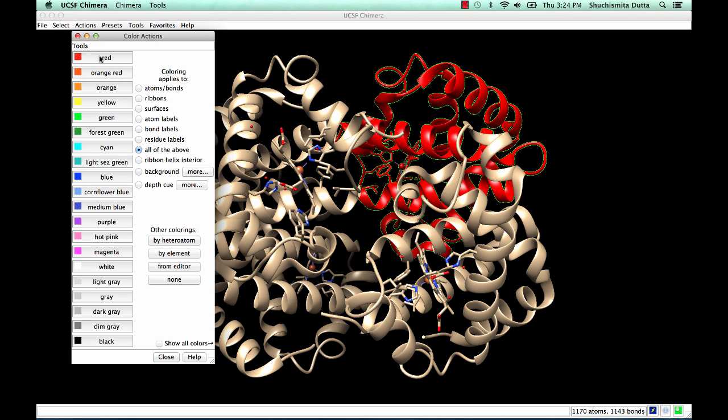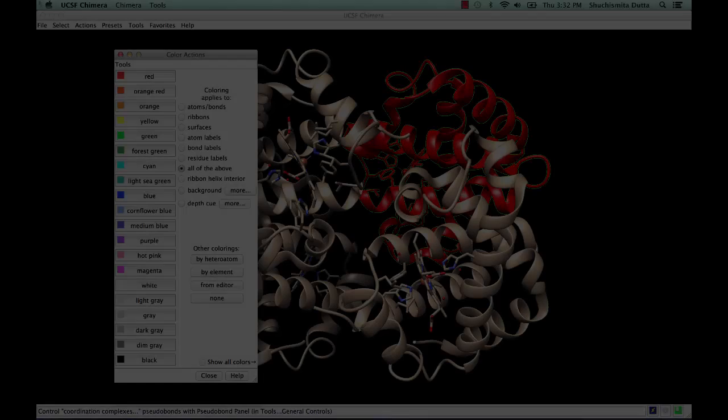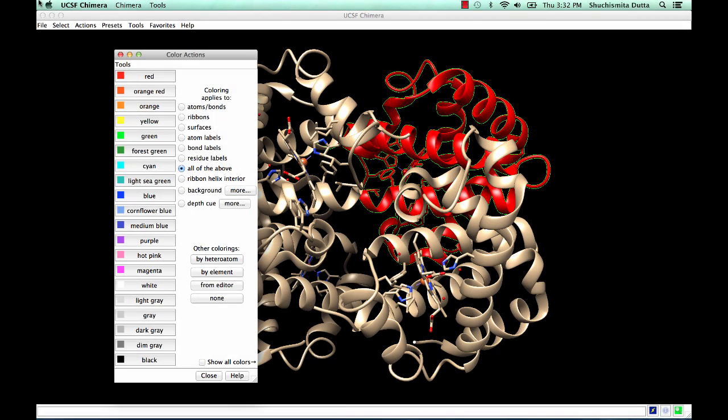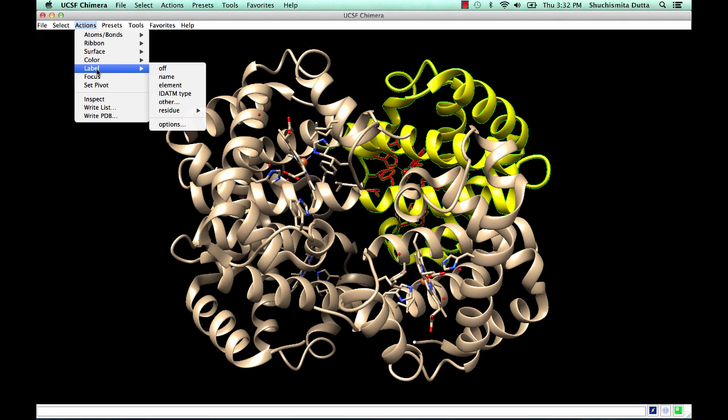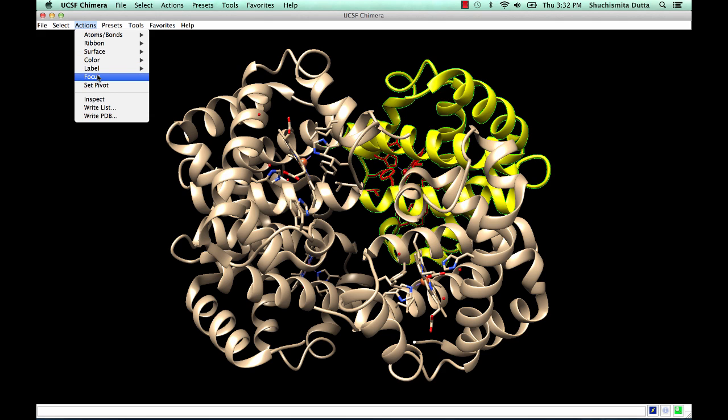So with the current selection, if we click on the red color, everything related to chain A is colored red. You can selectively change the color of the ribbon to yellow and focus on that particular chain.